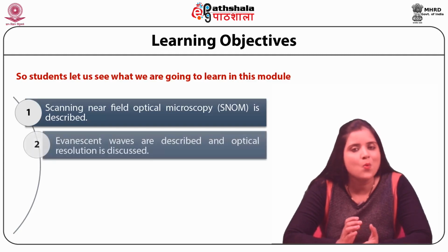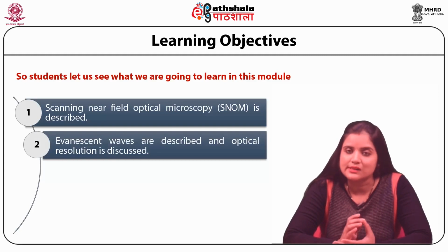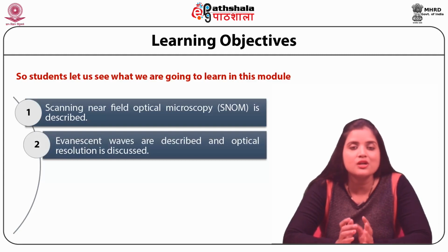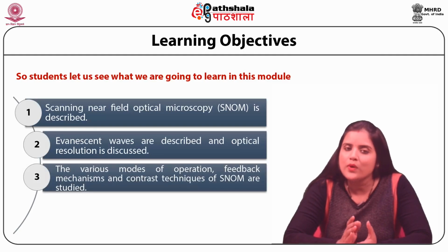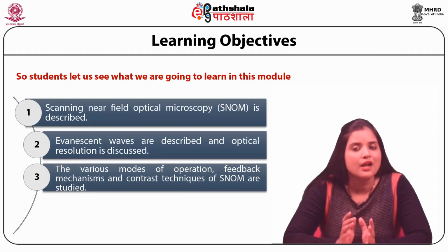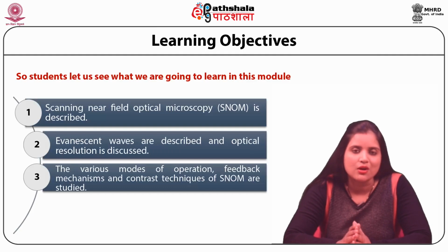Then the evanescent waves are described and the optical resolution is discussed. The various modes of operation, feedback mechanisms, and contrast techniques of scanning near field optical microscopy are studied in this module.